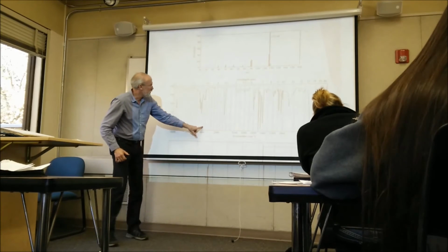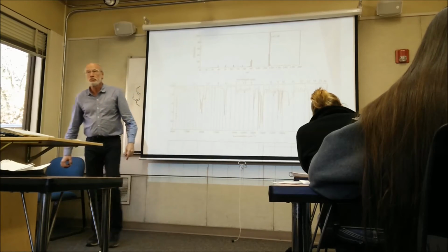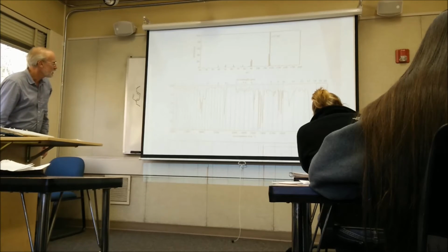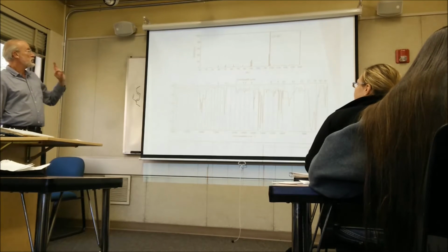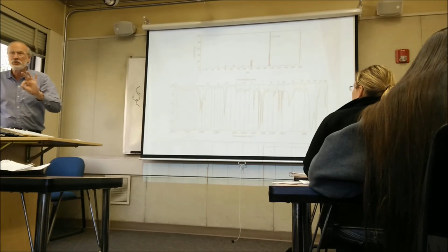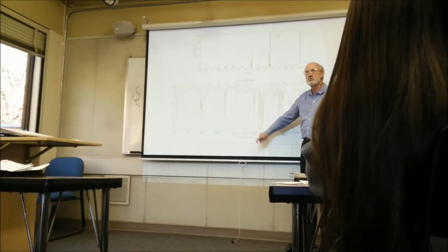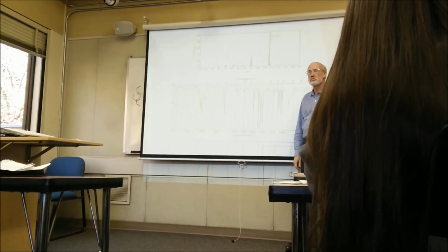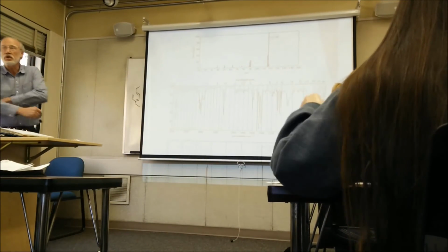We got a lot of unsaturation here because we see all these peaks above 3,000. Is that little thing under 3,000 the C-H from the aldehyde? Or is that incorrect? It's not, and the reason I can tell is because there's nothing anywhere near 1,700. Oh, right, yeah. Okay, so we've got CH stretches above and below 3,000 wave numbers.